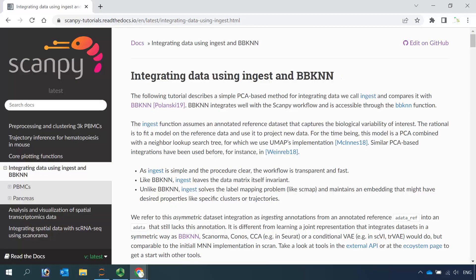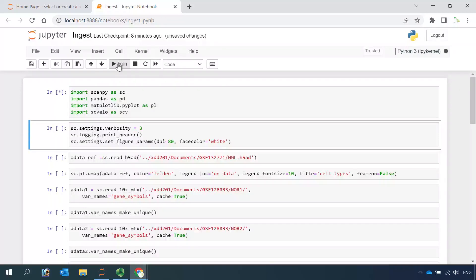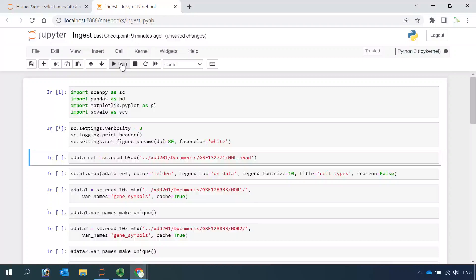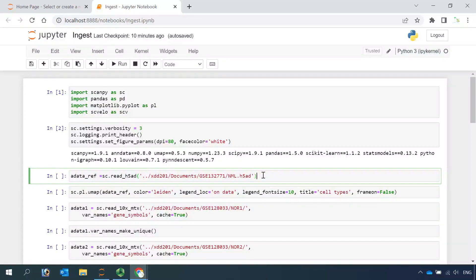So let's use the Jupyter notebook to do the analysis. First we need to load all the packages. Next we set some parameters for the data analysis. I'm going to use the dataset that we integrated using the BBKNN function. You can watch my data integration video tutorial for the BBKNN function. In that video, we analyzed three single-cell RNA sequencing datasets for healthy human lung from three different donors, and we annotated the cell types and saved the dataset. So let's read the dataset as reference data.